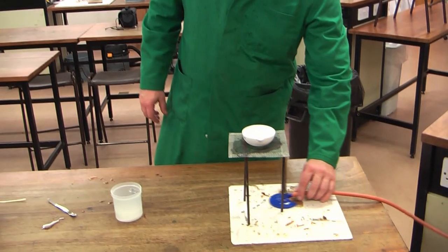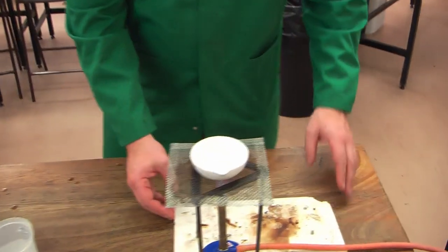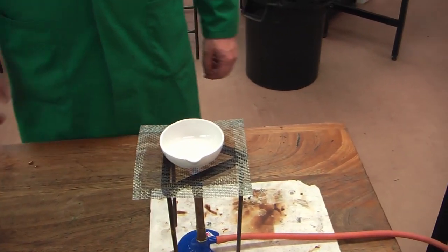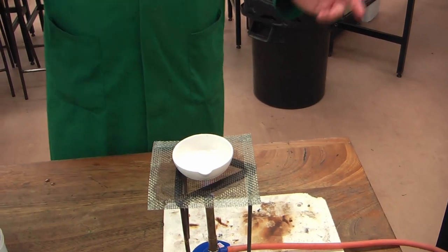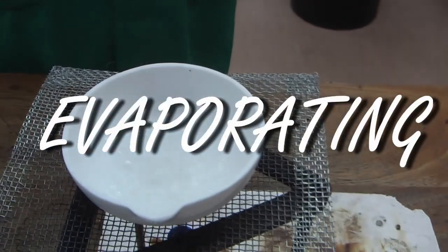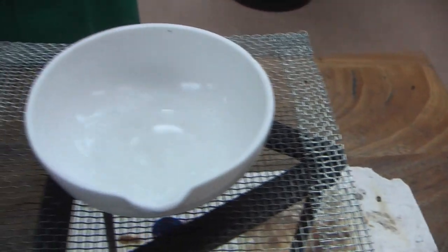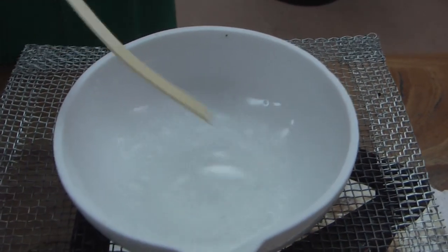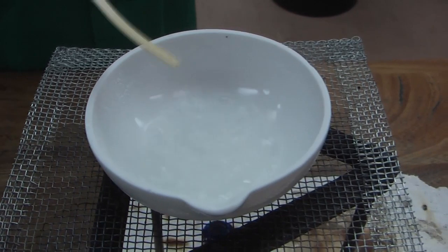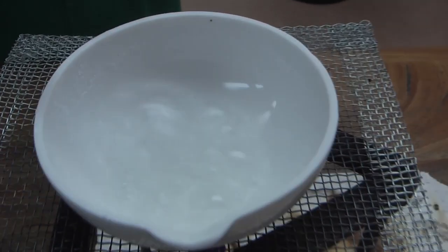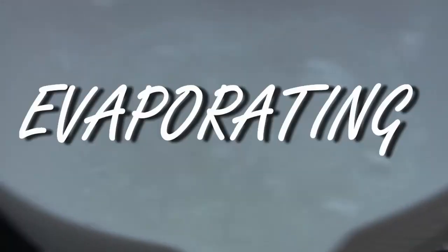And I'm going to do that by heating it. And as you recall from the changes of state video, when a liquid turns into a gas, it's called evaporation. It's going to evaporate off. So the whole term for this separating is called evaporation. So what I'm going to do very quickly, I'm going to put that under there. And we're going to let that heat up. And what's going to happen is this video will phase out. And then when it phases back, we'll be able to show the end of this. We're about two minutes into the boiling. If you have a look now, you can see it's boiling off nicely. So the water is evaporating quite rapidly. And on the side, I don't know if you can see it, but you've got little white deposits around the side. And that's the salt that's going to be there.